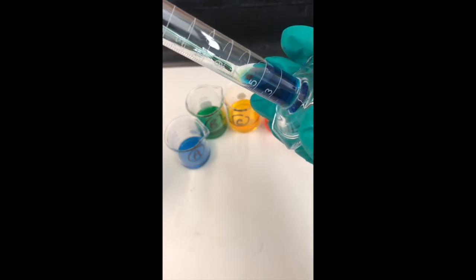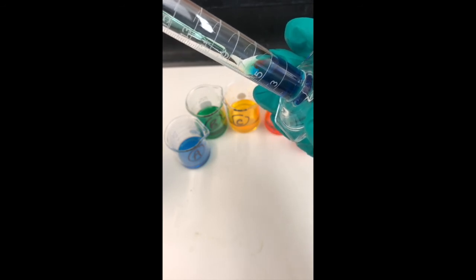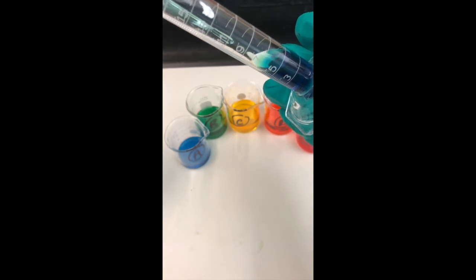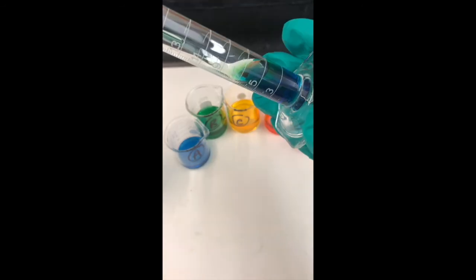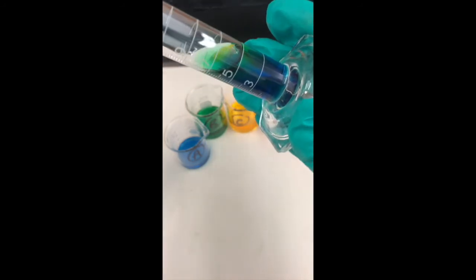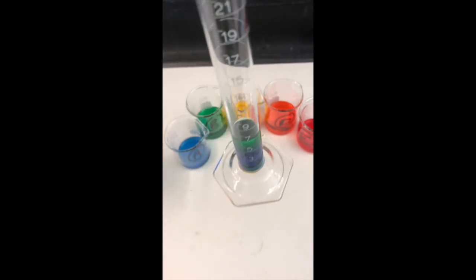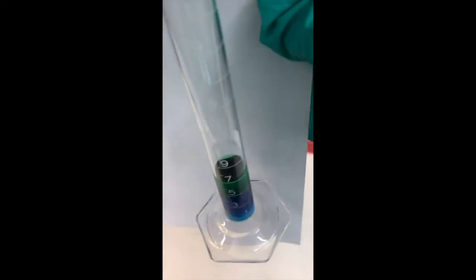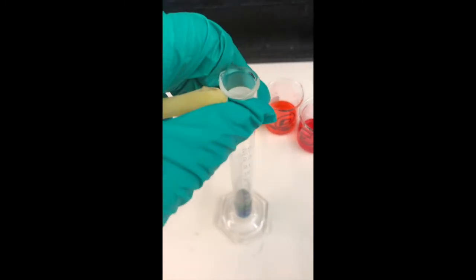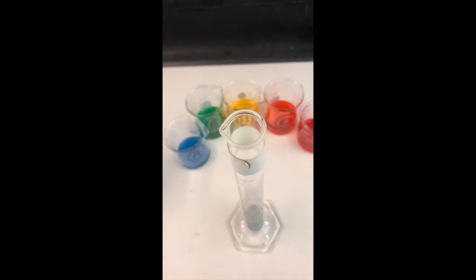all the way down, almost to the surface, and I'm going to slowly squeeze the bulb and layer my next solution. It's a little hard to see with the light right now, but you should start seeing our colors layering. I'll hold a piece of paper out for you all. You'll see that we're getting that layering. So you're going to go ahead and do this for the rest until we get to solution E and have the completion of our rainbow.